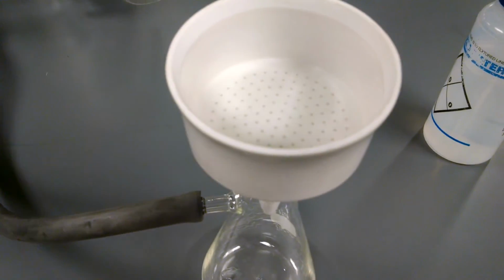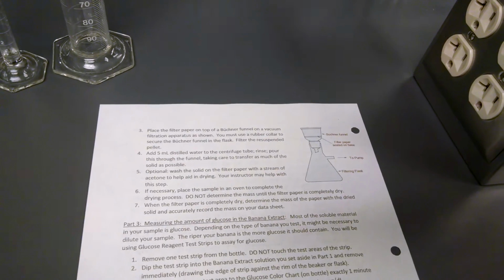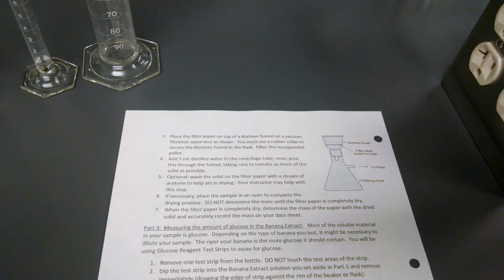We'll be calculating the percent starch in the banana. We'll also be calculating the percent glucose, and I'll run through the calculations in another quick video for you so you have an idea of how to do that.